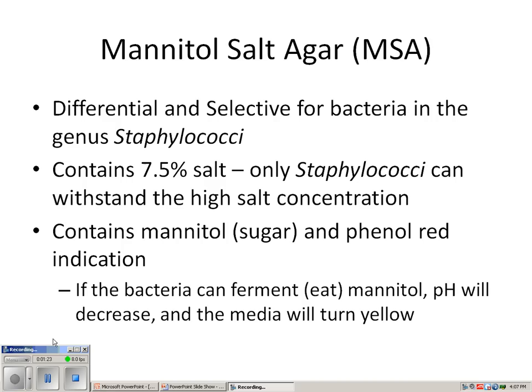The most common genus that grows well in the presence of high salt is Staphylococcus. However, Staphylococcus is not the only bacteria that can grow on Mannitol Salt Agar, and we'll see that as we go through the semester. Some textbooks state that MSA is selective for gram-positive bacteria, but that is not true — not all gram-positive bacteria are halophiles.